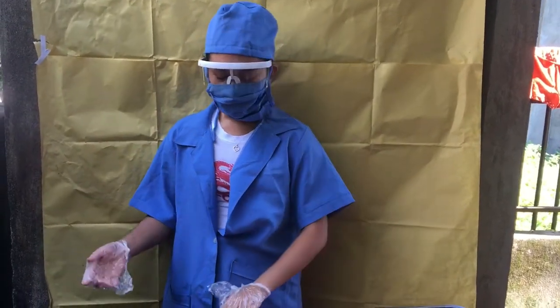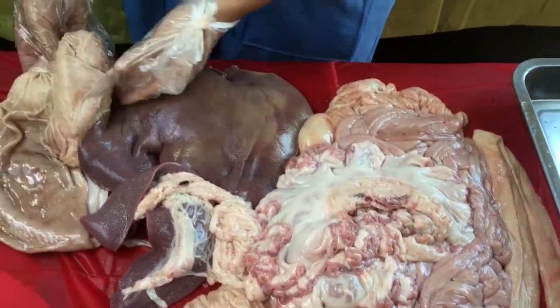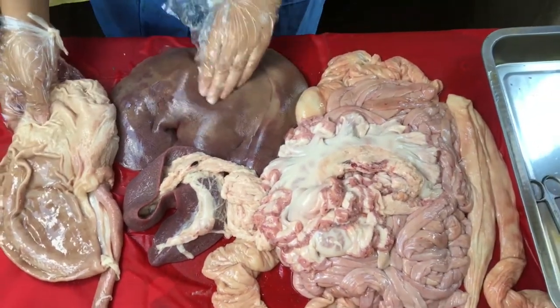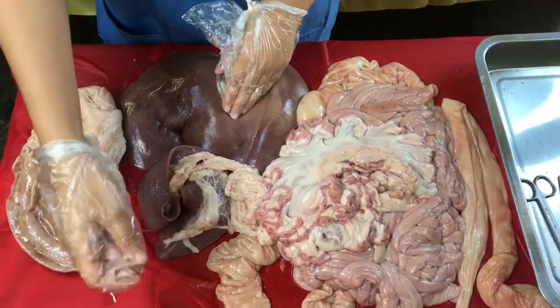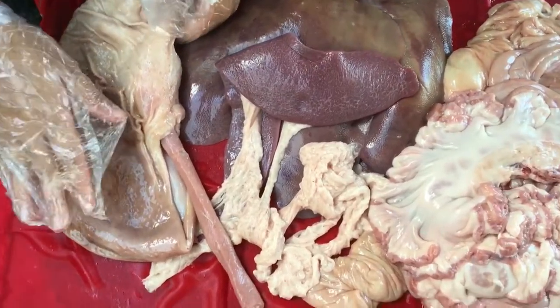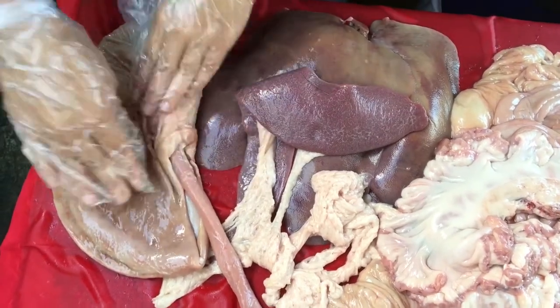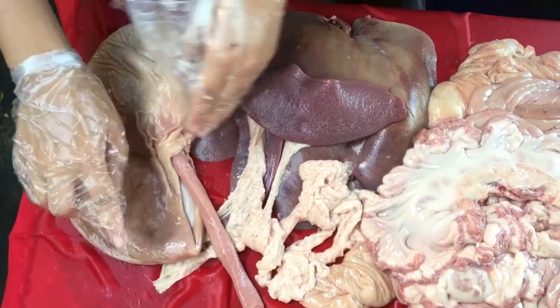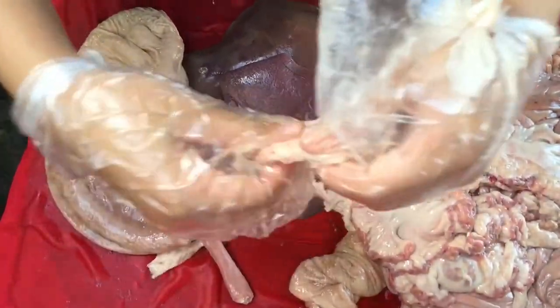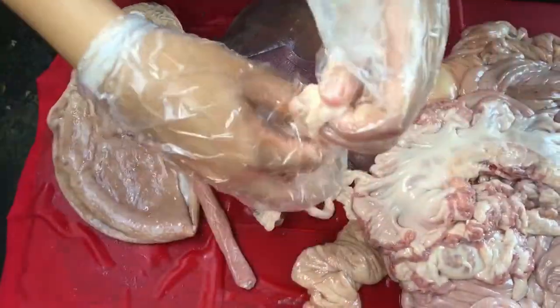So we will first dissect the stomach. As you can see here, it is already separated from the liver because the butcher has cut it off. The first thing that we are going to dissect is the stomach. The stomach is covered by the membranous structure of the omentum. This one is the omentum.